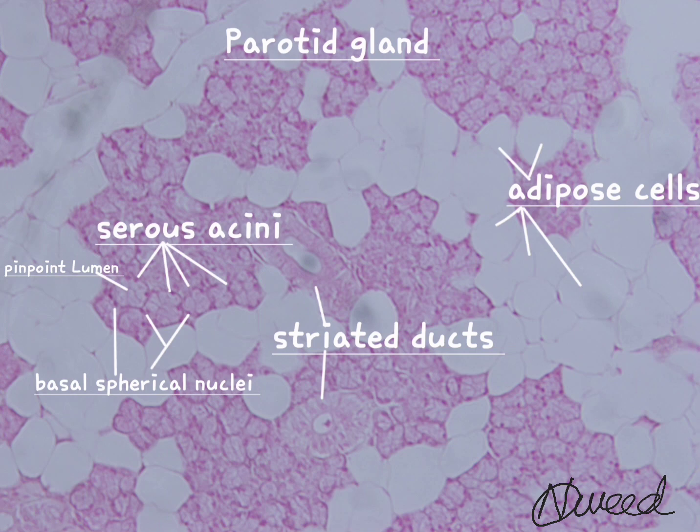The septa carries ducts, nerves, blood vessels, and lymph vessels. This is a slide of the parotid gland. The parenchyma of the parotid gland consists of only serous acini. The serous acini are spherical structures, each consisting of secretory epithelial cells arranged around a central cavity.